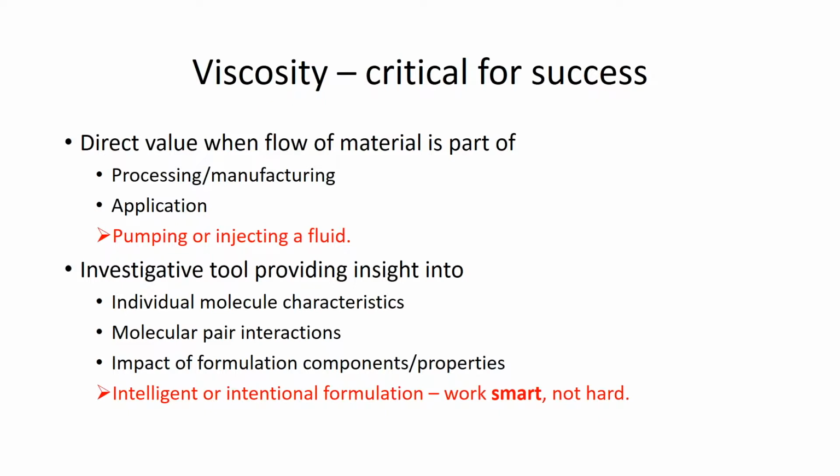Something that's not thought of quite as often is that rheology, viscosity specifically, is very useful as an investigative tool. And doing these measurements can give you insight into how the individual molecules behave, what their characteristics are, and also into protein-protein interactions or molecular pair interactions. And both of these will also depend on the formulation components. So what else do you add into your solution medium that's going to modify how the individual molecules behave and how they interact with each other?